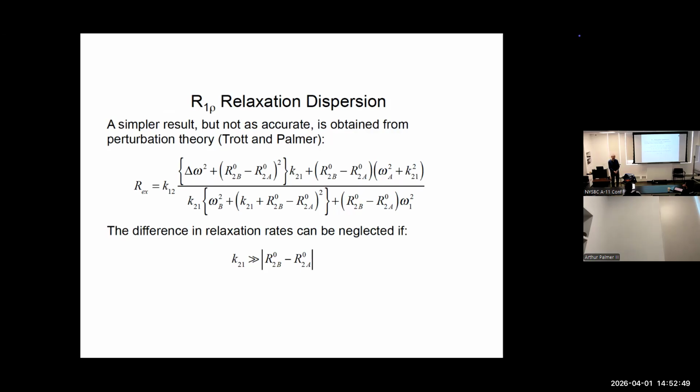the two rate constants. And again, the DEST experiment was introduced by Fawzi and Tjandra, but way back in the 60s, Alan Allerhand, when working out the first CPMG expressions, distinguished between what he called C and R chemical exchange effects. And C effects were caused by the jump between the shifts, and the R effects were caused by large differences in relaxation rates in the two states.